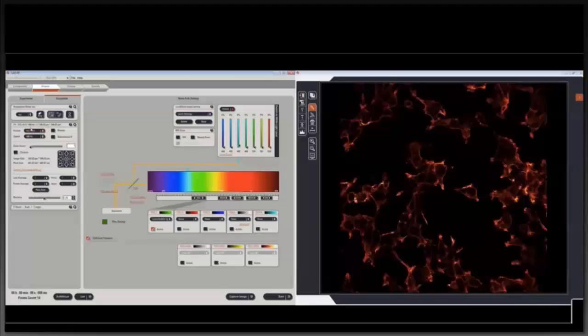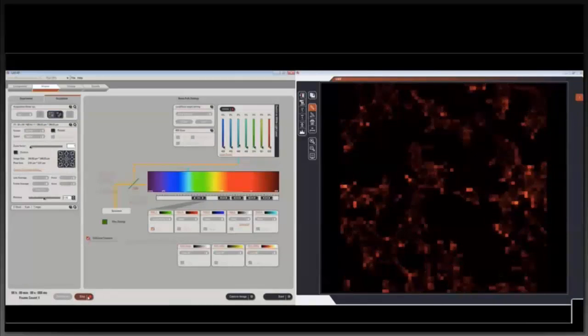So at the moment I've got a pixel grid of 512 by 512. And we can see here this means that our pixel size is 481 nanometers. One advantage with confocal is that we can actually change this. We can change the number of pixels within our image. Say I change this to a much lower number, let's go with 64 by 64, and let's go live. You can see now there's a lot of information lost by doing so, but it's scanning a lot faster.